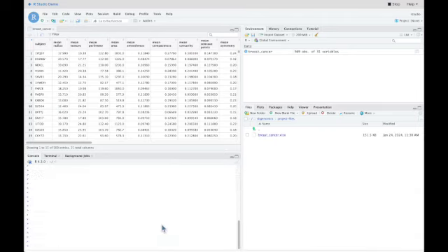Okay, so once you've finished with whatever analysis you are interested in, it's time to save the file back into your project space on the CGC. As I mentioned earlier, the project files directory is read-only, so you'll be able to load files from this directory, but you can't save them back. Instead, we'll use output files here.